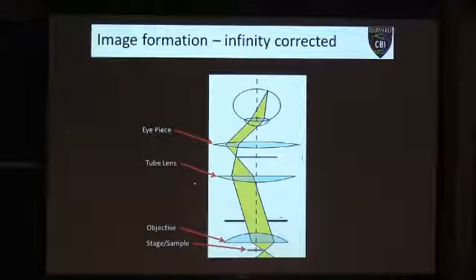And then we have what's called the tube lens. This tube lens takes these parallel rays and then reconverts them into positions again. So this is an image plane here where all these converge. And then if you're looking through the ocular or the eyepiece on the microscope, you have an additional lens that converts that positional information back into parallel rays again.